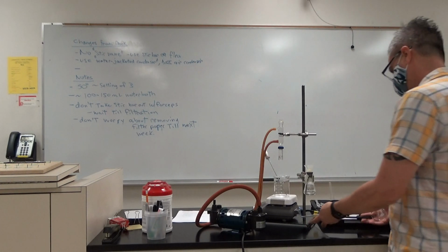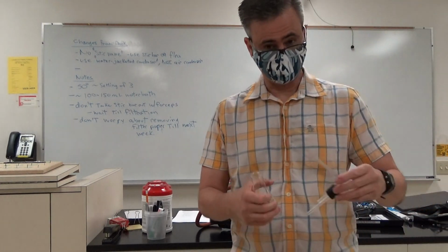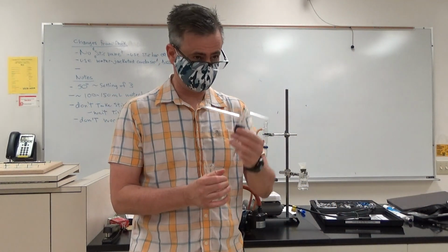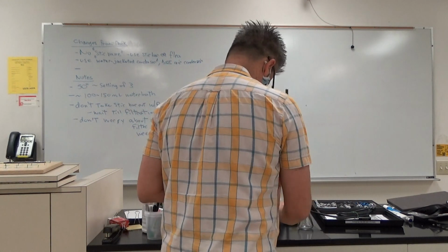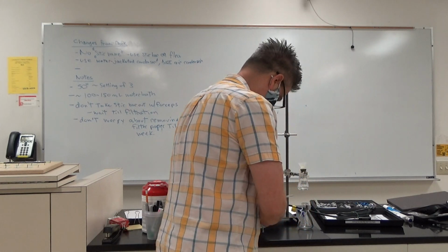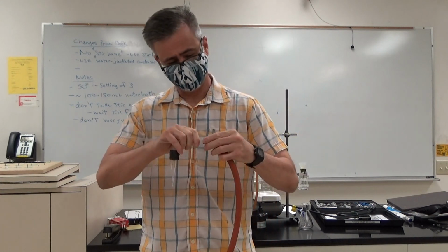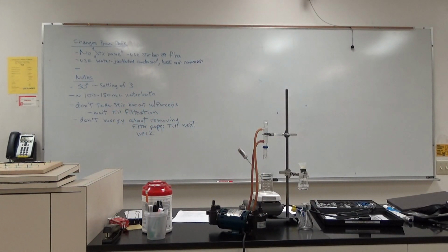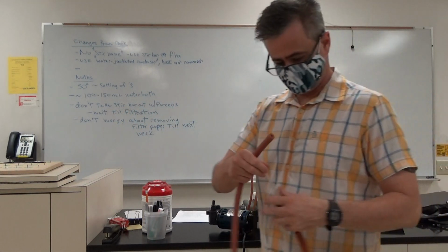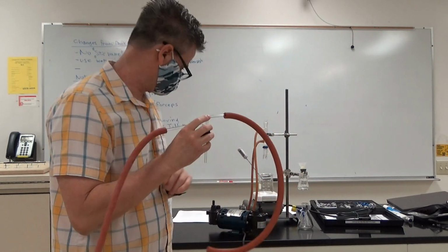we're going to use what's known as a trap. Okay? So I forget what the sheet calls this thing, but we're going to use this thingy thing. Okay? Here, perfect place. Grab it on the end. Don't grab it back here and impale yourself. Okay? Twist it on. That's enough. Don't need lots and lots. Twist it on. Okay?